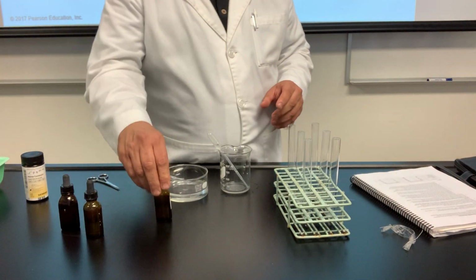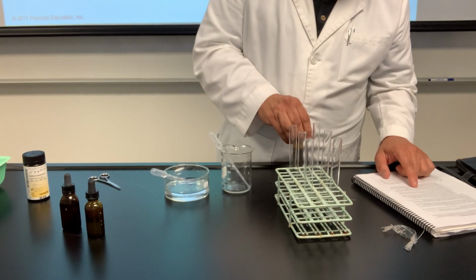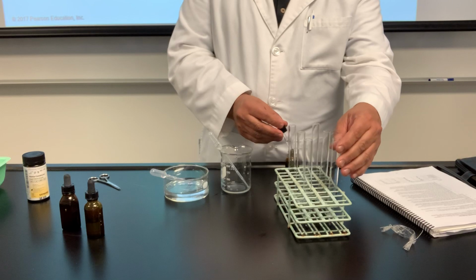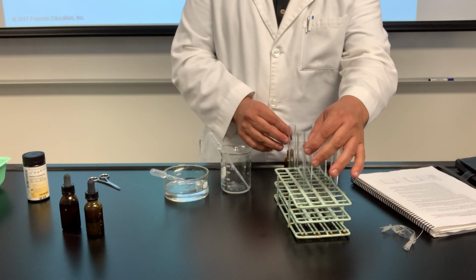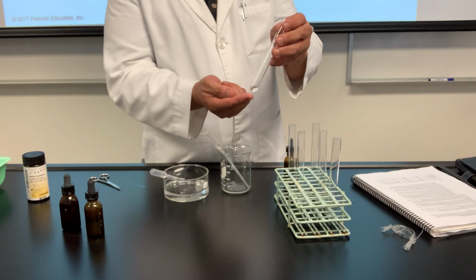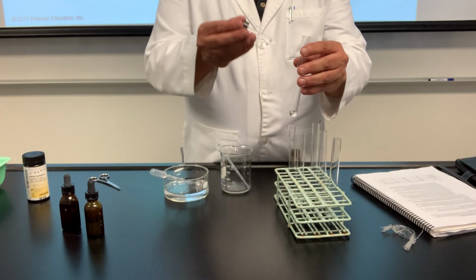Okay, the next one is barium chloride. And it tells you barium chloride is looking for sulfate. Do the same thing. Okay, we're going to do it in a different order now. I'm looking at the outside one right now. Is sulfate outside? Yes, because that's part of solution B. It's also a white precipitate.